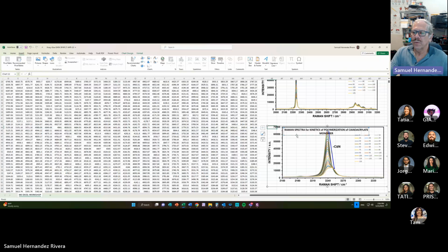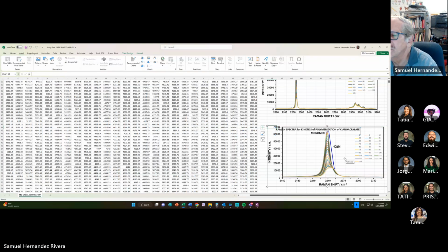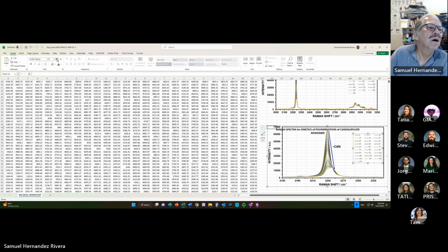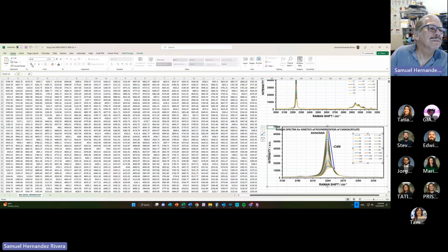So as Jorge mentioned, we're not only displacing the signal towards higher wave number, which would mean what? Anyone?